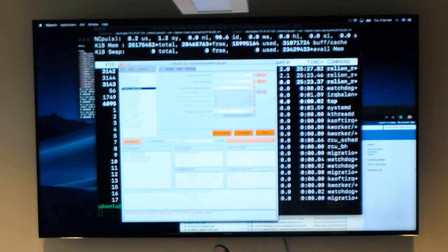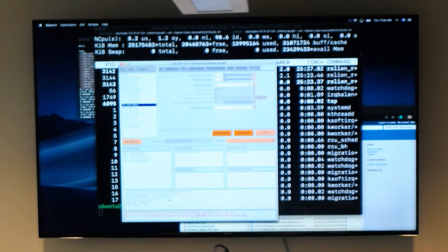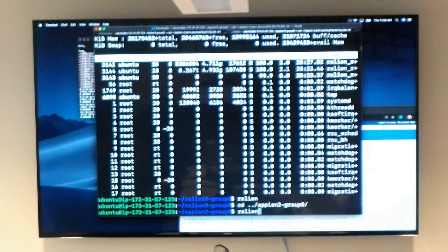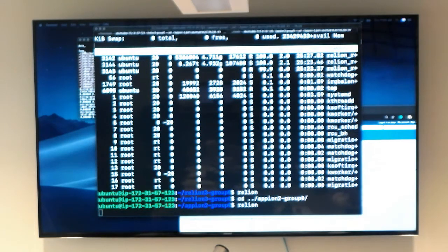So I'm just going to go over some results. I wonder how far I've gotten here. Only 8 angstroms so far. Okay, I'm going to pop into another area, into the folder that's already been run, and go over some of the outputs that you can expect. Then we'll take a short break and change over to CryoSPARC. But this is to give you a primer of certain things that you can do.